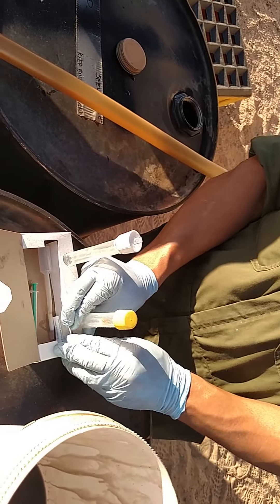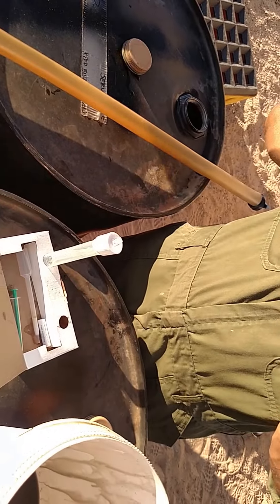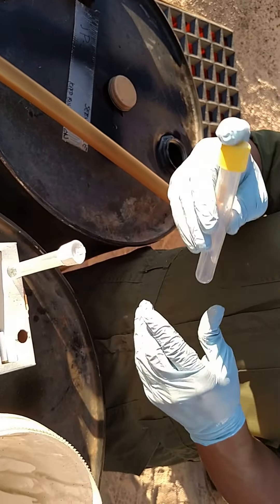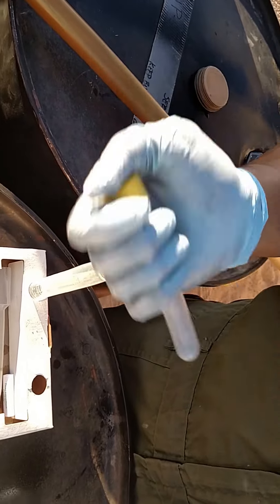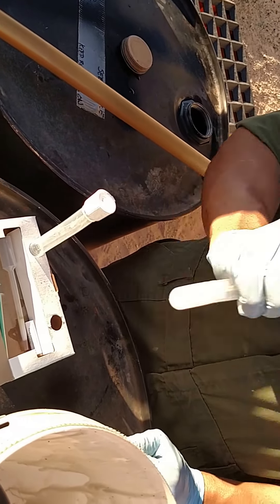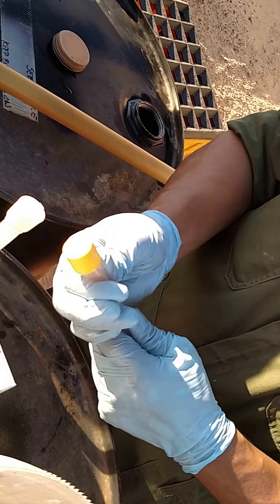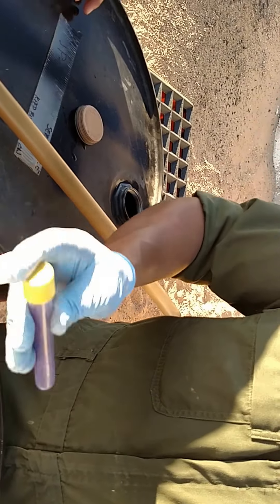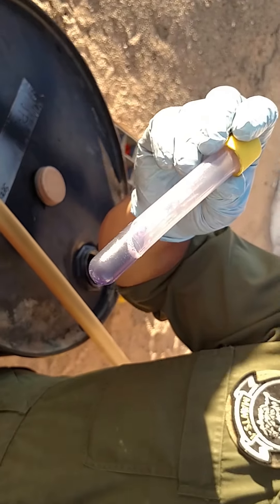Pop the first vial on the bottom, shake it for 10 seconds. Shake it vigorously for 10 seconds. All right, now pop the second one and then shake it — watch this pretty purple color come up. Hold it up — oh, that's a sign of a good sample.